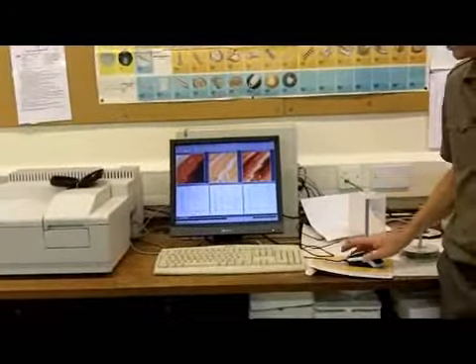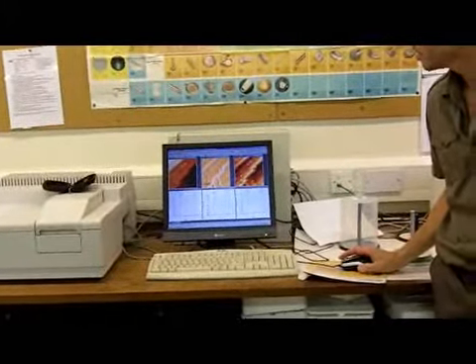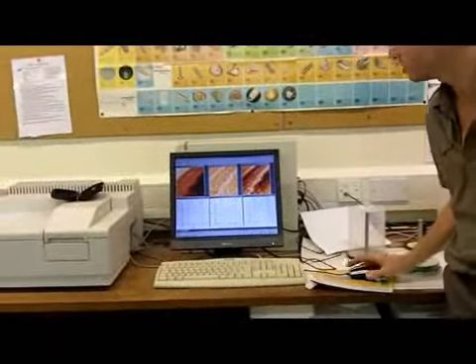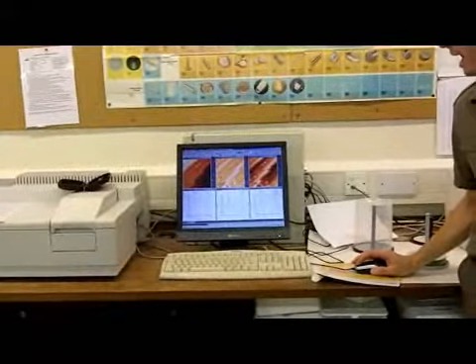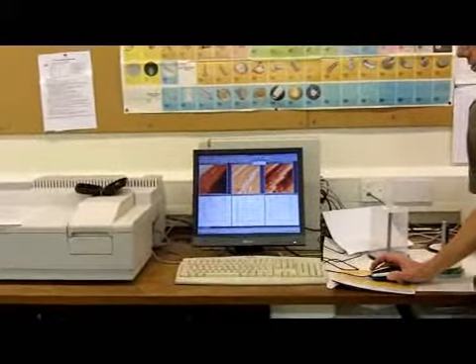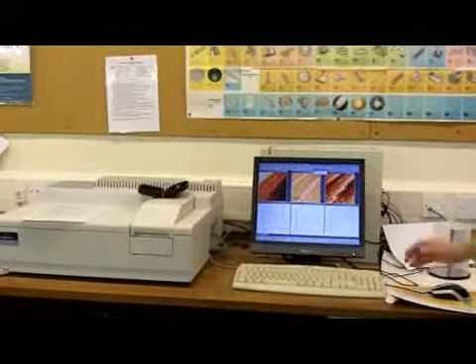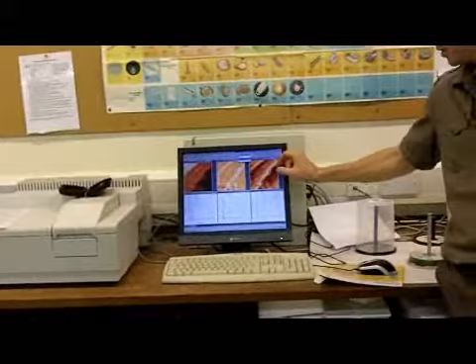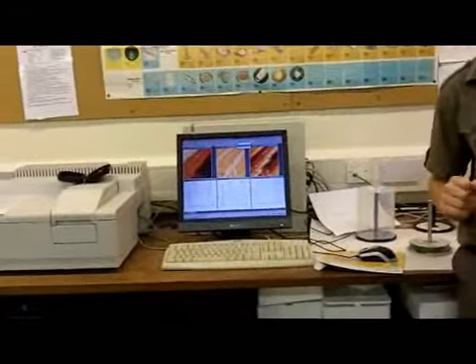Okay, only one more thing to show you with this, and that is if we go back to an image, let's go back to this image, it may be that you want to concentrate on a small feature in this image, in which case we'll want to zoom in. This magnifying glass here is the zoom. Again, there are 3 different zooms. There's the simple zoom, which will zoom in on a box that you draw on the active image. Multiple zoom, which will zoom in on the box that you draw on the active image but will reproduce on the other images you ask it to.